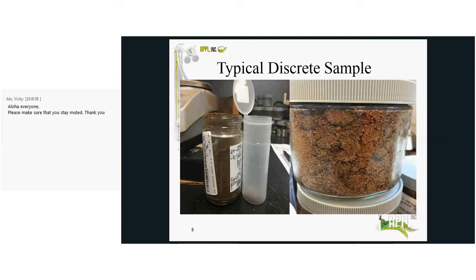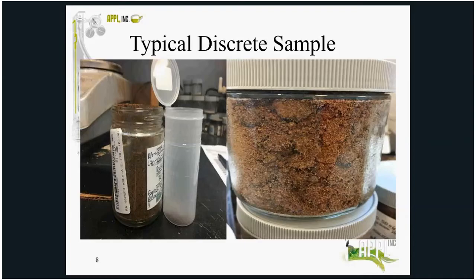Stirring a bulk sample in a container would not only increase heterogeneity, as finer particles would go to the bottom, but taking a single or even replicate samples just from the surface of the container would be expected to significantly underestimate contamination for contaminants like metals, where higher concentrations are typically associated with the smaller particles.